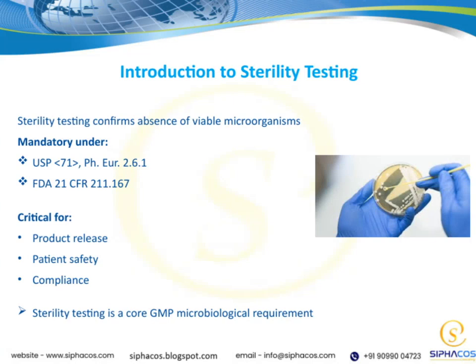Welcome to our discussion on sterility testing. So, what exactly is sterility testing? It's a process that confirms the absence of viable microorganisms in a product, ensuring that the product is free from any living contaminants. This step is not optional. It's mandatory under several key standards and regulations.